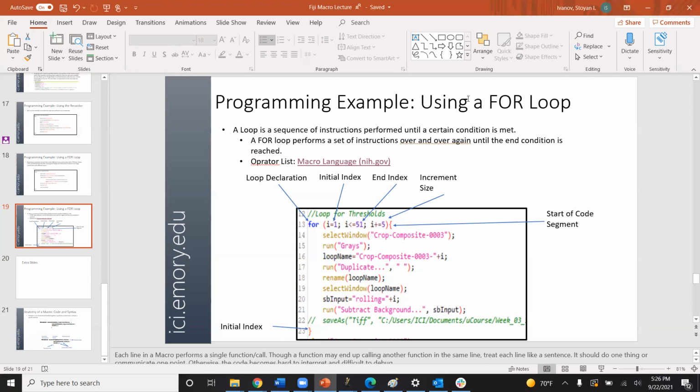That was a little complicated, but does that make sense, Gaurav? Yeah, it does make sense. So loop name is a new variable that you are using, and for different functions, you are invoking that variable for further image calculations. Is that correct? Exactly.